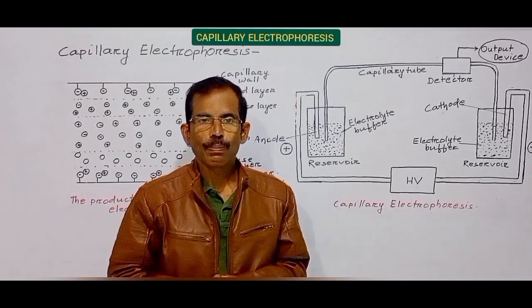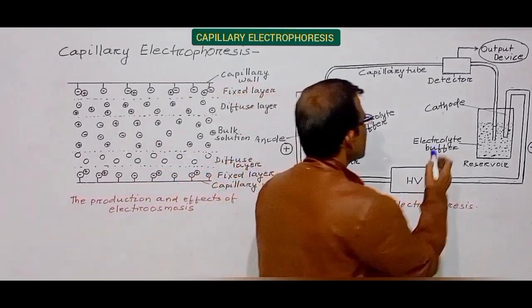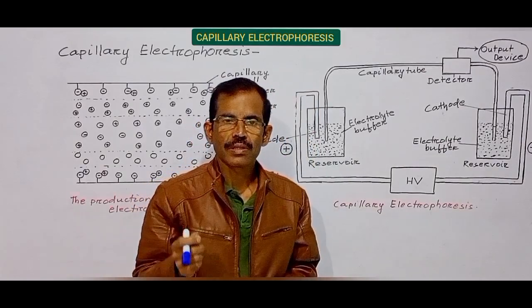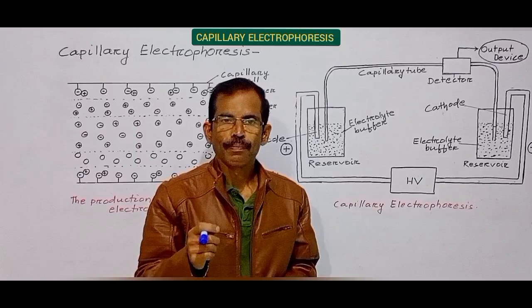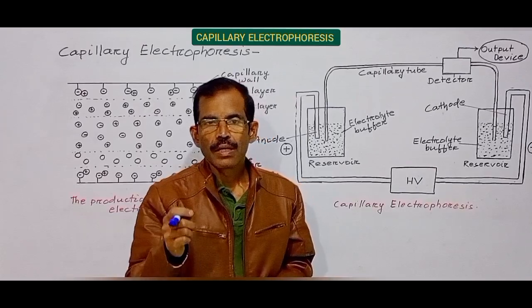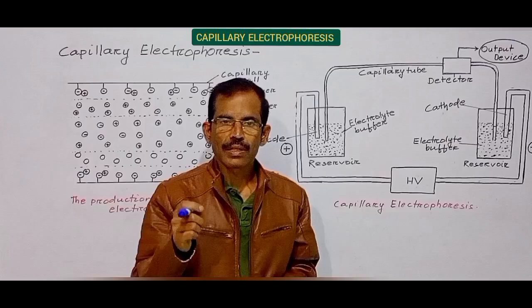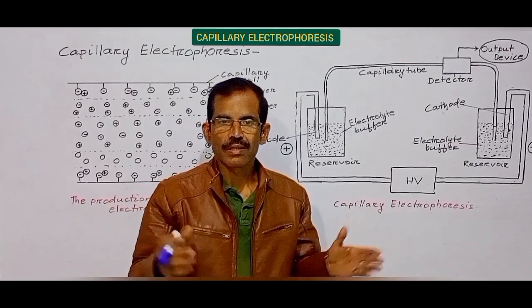One of the most important components of capillary electrophoresis is the detector. Detection schemes for capillary electrophoresis include measurement of UV absorption, refractive index and fluorescence. Electrochemical signals and conductivity as well as radioactivity from radioisotopes have also been measured.